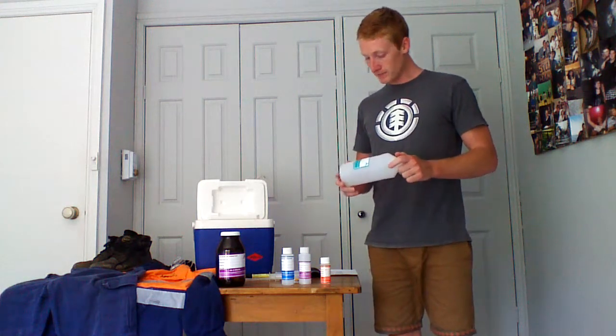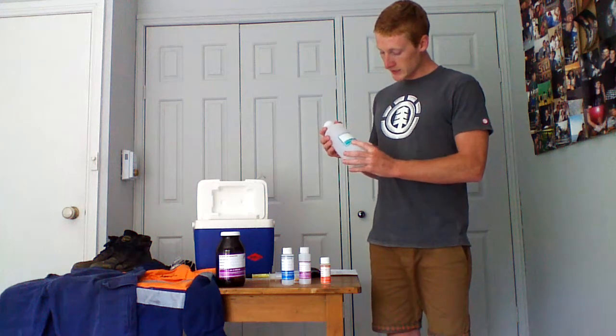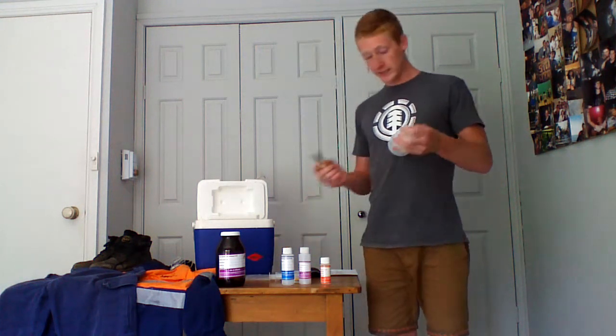Choosing our container, we choose a green label. We can see on here that there are no chemical preservatives, which we don't need for those target analytes. And for those three analytes we need a litre volume of water. So we've got a green label, litre volume, and the correct method is to record our details on the label first.